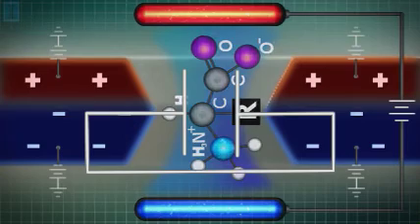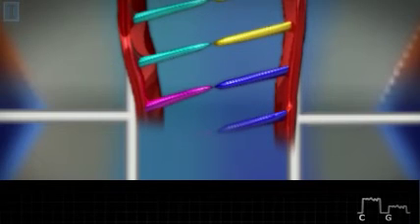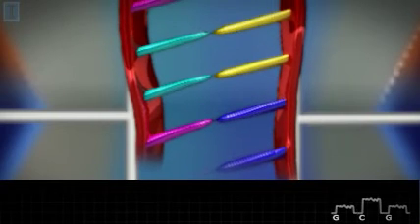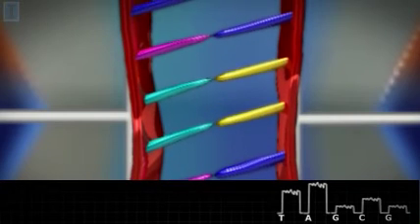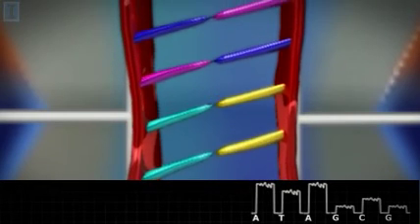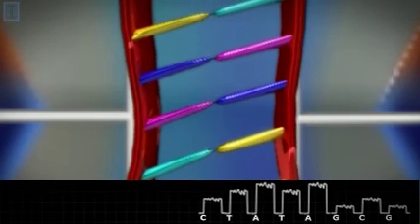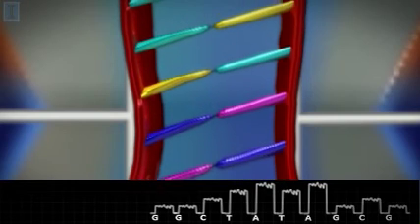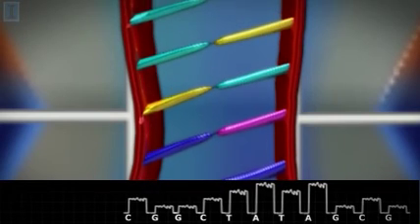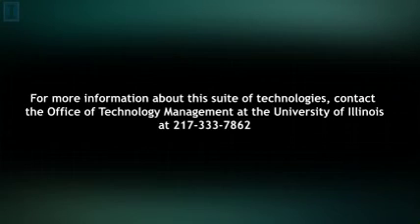Finally, with the correct arrangement of pore geometry, plate potential, and correct membrane charge bias, it will be possible to pull a strand of DNA through the diameter of the pore, effectively straightening out the strand. This change in structure will cause only 1/2 of a base pair to enter the effective pore. A manipulation of field, combined with the straightening of the DNA, allows impedance changes in the pore, corresponding with each half of each base pair to be measured.